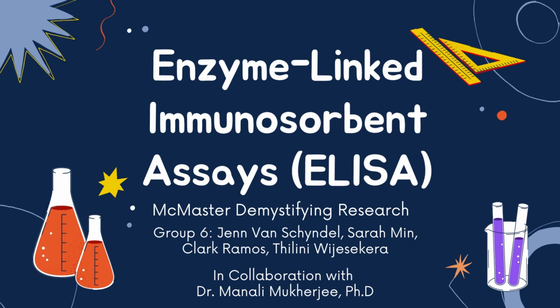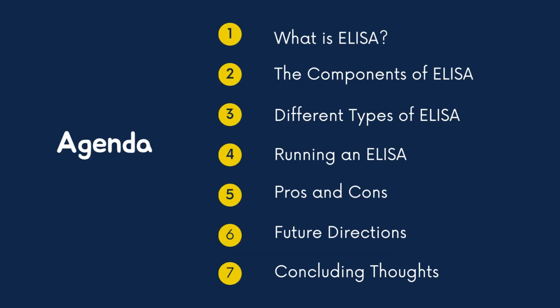Today we'll be looking at Enzyme-Linked Immunosorbent Assays, or ELISA. In this video, we'll be looking at what ELISA is, the different components and principles, the different types of ELISA, how to run this assay, the pros and cons, and future directions for this method.